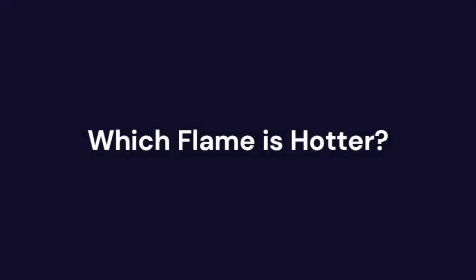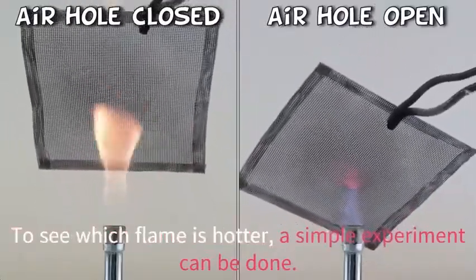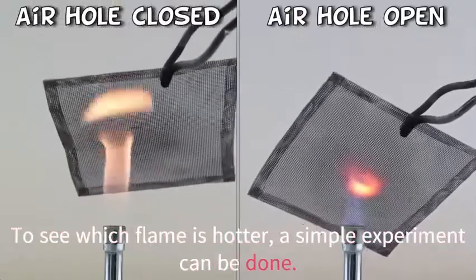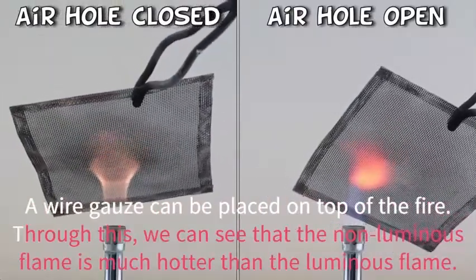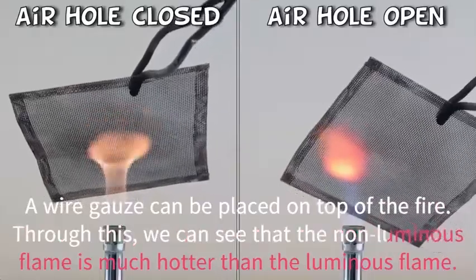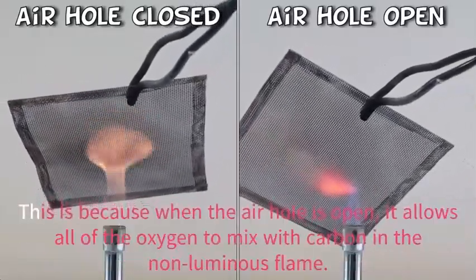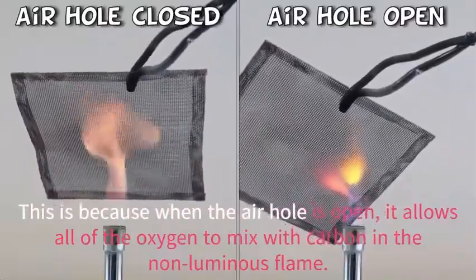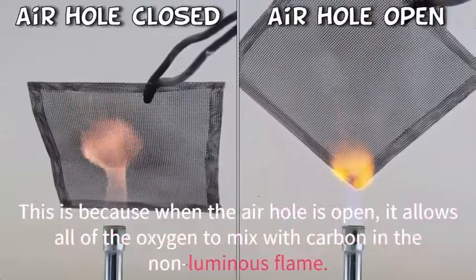Which flame is hotter? To see which flame is hotter, a simple experiment can be conducted. A wire gauze can be placed on top of the fire. Through this, we can see that the non-luminous flame is much hotter than the luminous flame. This is because when the air hole is open, it allows all of the oxygen to mix with carbon in the non-luminous flame.